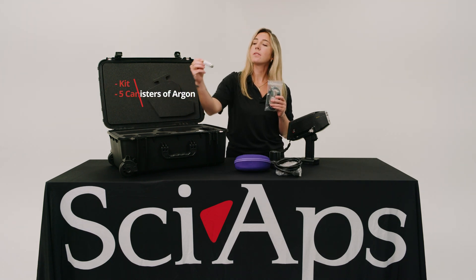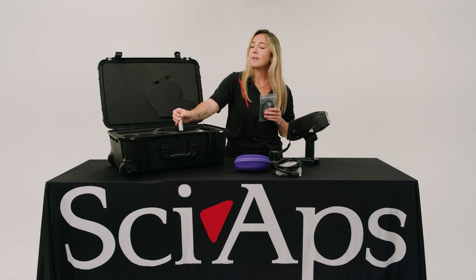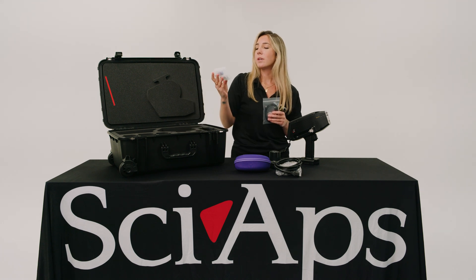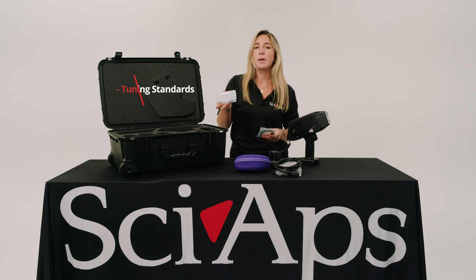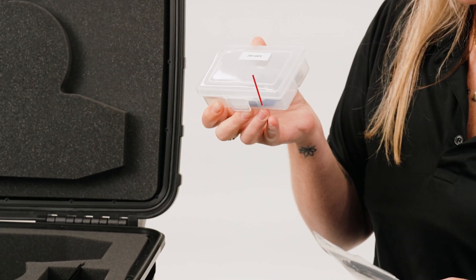Five canisters of argon are included. If it is blue label, that means it is carbon. If it is black, that means it is standard argon. Here you have all your tuning standards, and these will be different depending upon what analyzer you order.